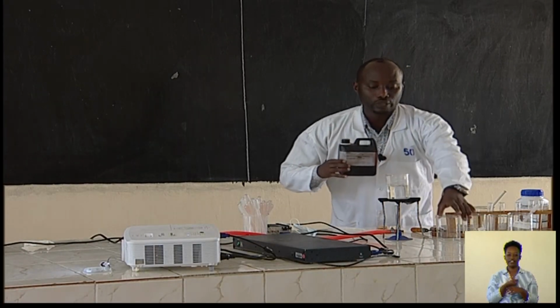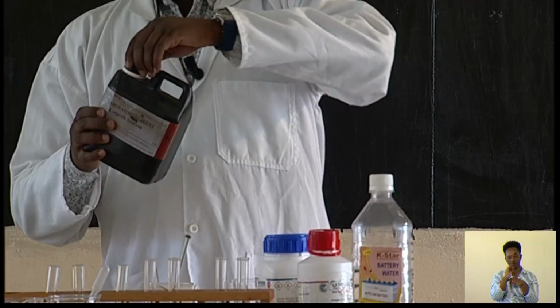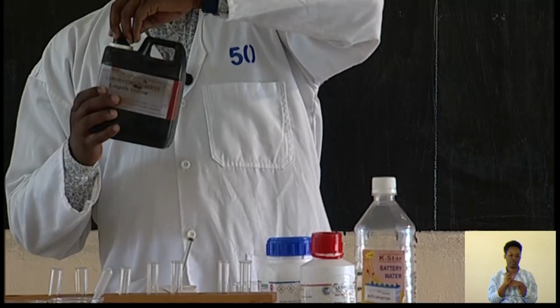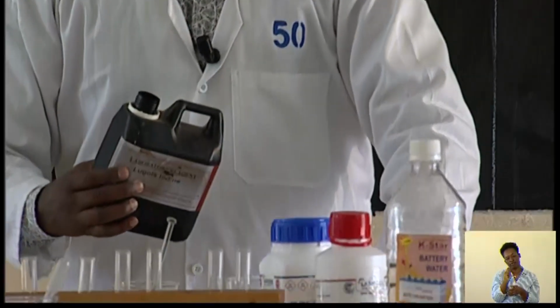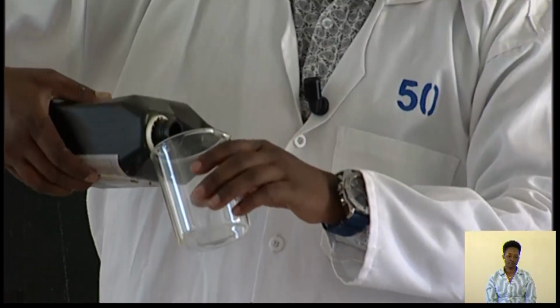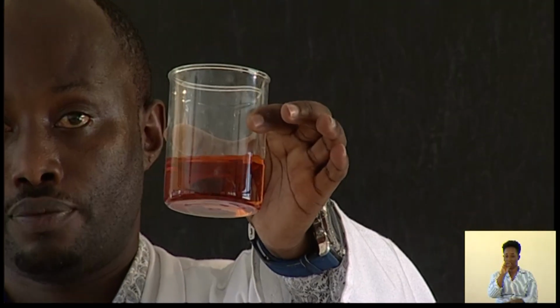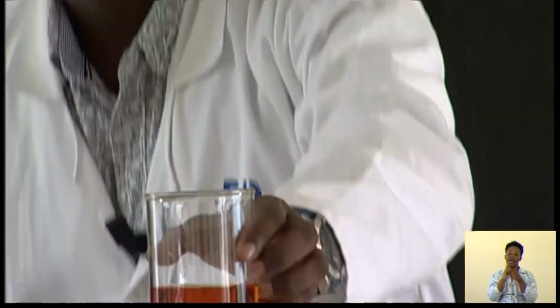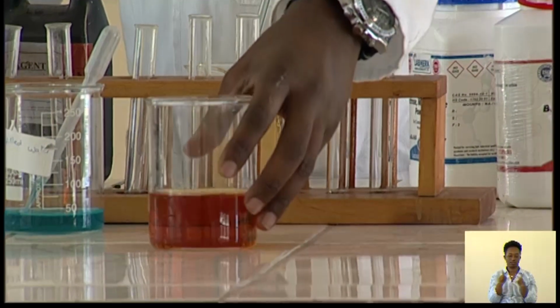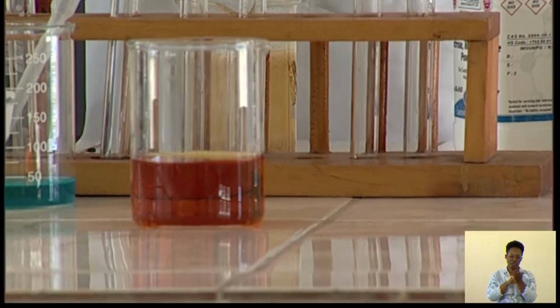So student, let me show you the color of the iodine. It is brown in color. That is the reagent we use to test the presence of starch in a food sample. Quickly, let me pour the iodine solution so you can see and observe. This is the color of the iodine solution. It is brown, and we use it to test the presence of starch in a food sample.